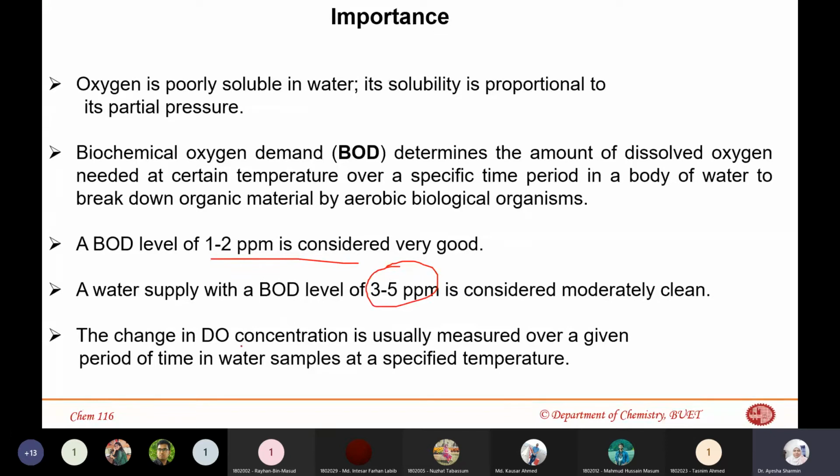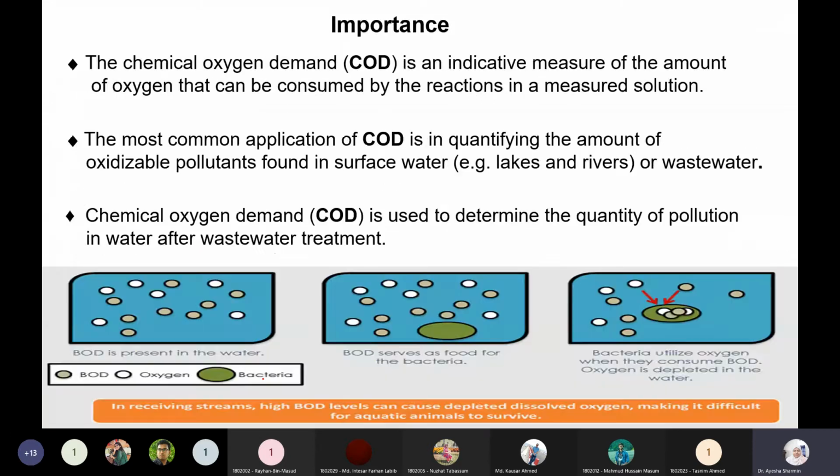Okay, so the change of DO concentration is usually measured over a given period of time in water samples at a specific temperature. It's just the same thing. So this is how things are going. Now, this is for the BOD.